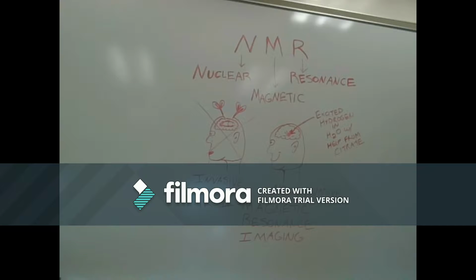Nuclear magnetic resonance imaging is a non-invasive diagnostic tool used in MRIs. MRIs measure the T1 relaxation of the hydrogens in water molecules in the body. Contrast agents extend and excite the T1 relaxation time to allow for a higher quality image during MRIs. For our class, the T1 relaxation was similar across the three combinations, but the maximum intensity observed was much higher in the 100% citrate solutions.